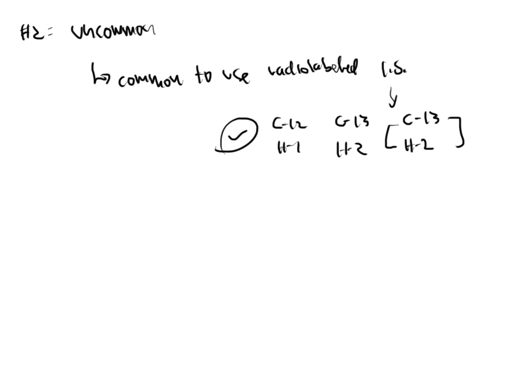So now that you know what goes into picking out a proper internal standard, we now need to take a look at the data. What are we to expect when we run these standards? All right, so first off, we're going to make up an example as we go.